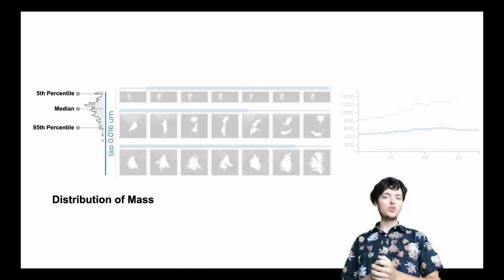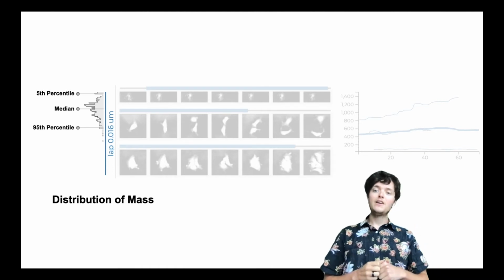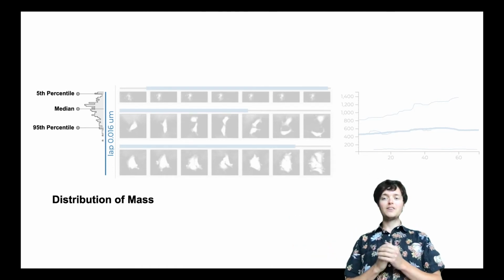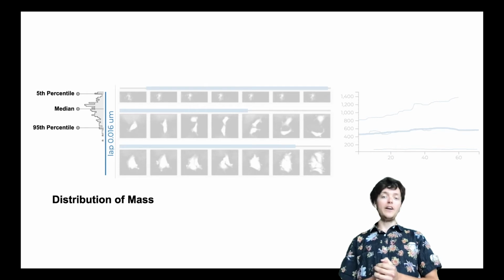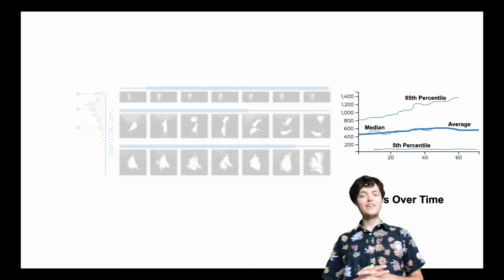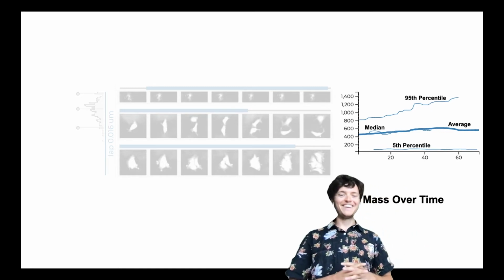In general, it will show however you are sampling those tracks. One nice thing about that is with those pins in the far left, you can see where those cell tracks lie on that distribution.